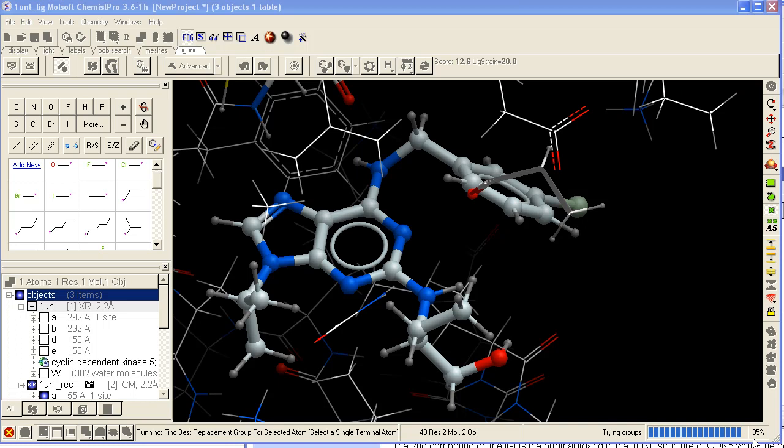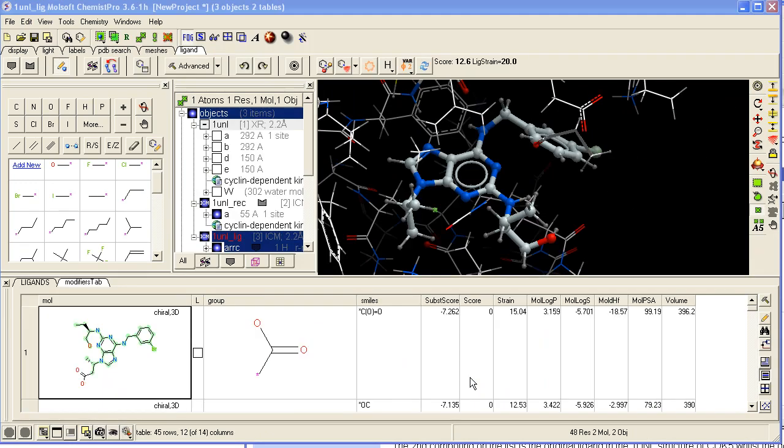Once it's finished, a table will be displayed of all the substituents along with the score for the binding of that substituent. So here is the score. The lower the score the better. So this is the best substituent.